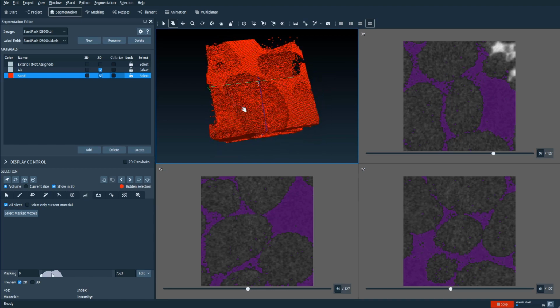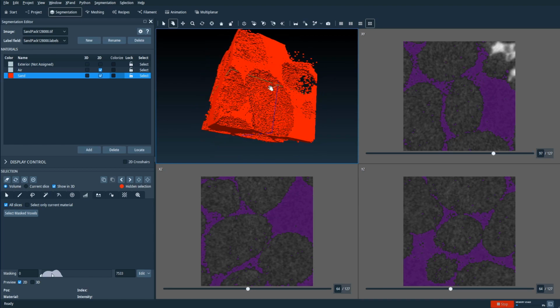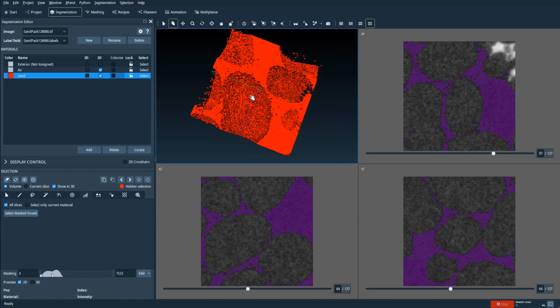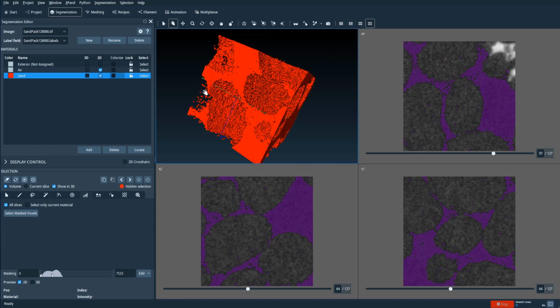So you get your selection pretty quickly, but in this particular example, because the data set is noisy to begin with, we have these outlier selections over here, and I'm not sure if you can see it clearly, but those correspond to these spots over here, right?